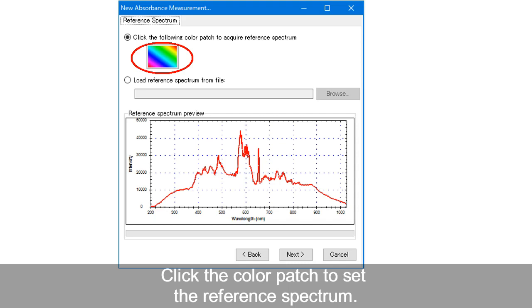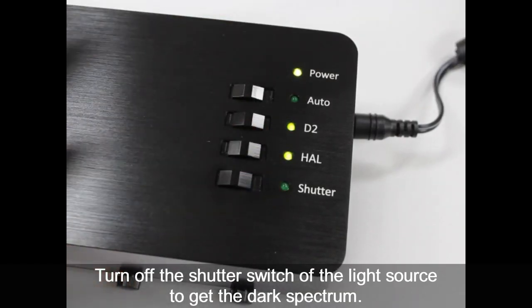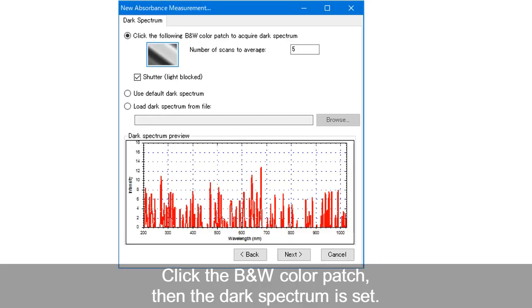In the reference spectrum, click the color patch to set the reference spectrum. Click Next. In the dark spectrum, first turn off the shutter switch of the light source to get the dark spectrum. Click the black and white color patch to set the dark spectrum. Click Next.